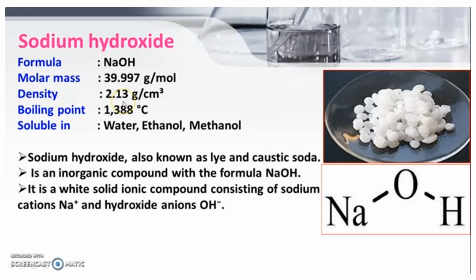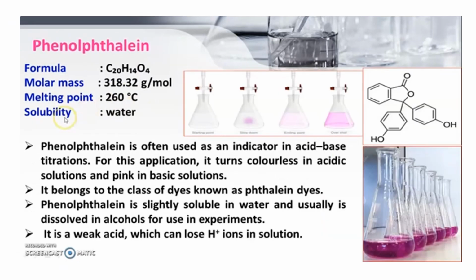It is very important to measure sodium hydroxide in a small beaker rather than on paper, because once you put it on paper, it may become liquid there.